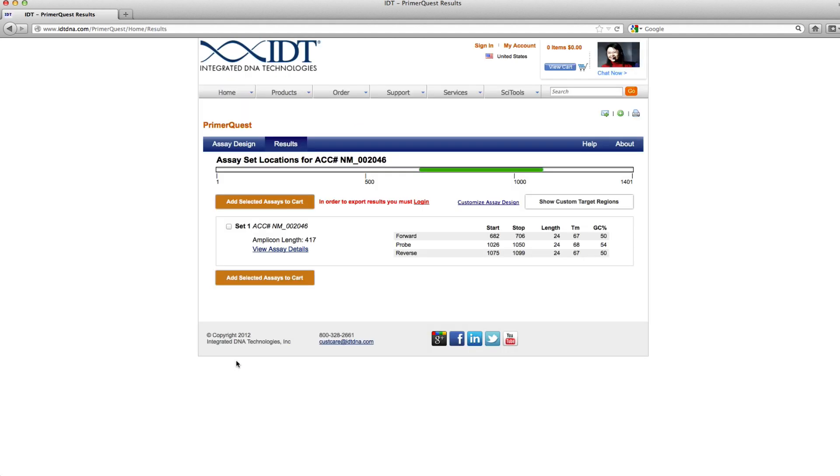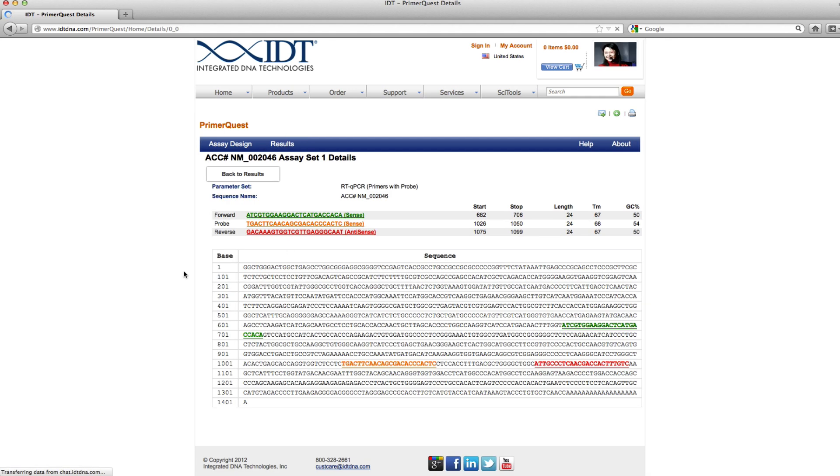I'm going to go ahead and click get assays, and as you can see it did give me one set returned. If I wanted to see the actual probe sequence, I can go ahead and click view assay details just to double check to make sure that my forward and reverse primers are the ones that I actually input into the tool, which it is.